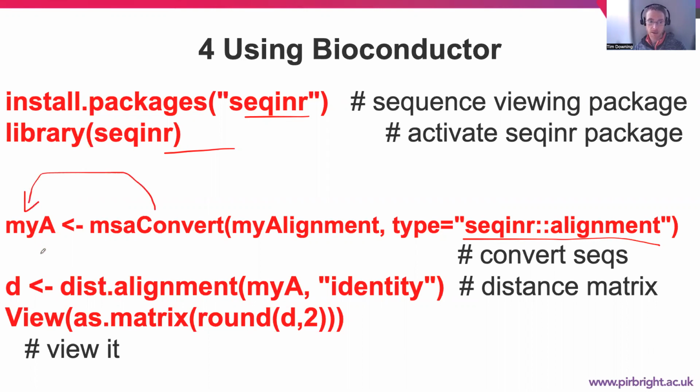And then we're going to send that down here to construct a distance matrix between each sample pair and populate that in a distance matrix. So we just get a square table of each of the samples and their relative distances based on this 5 kb segment.